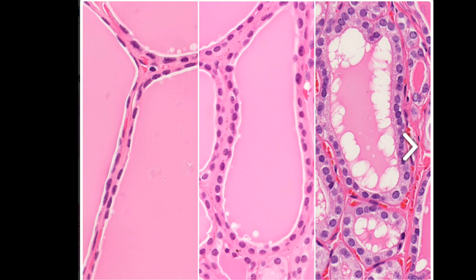This picture shows the simple squamous epithelium of hypoactive thyroid follicles, the simple cuboidal epithelium of metabolically active thyroid follicles, and the centrally located colloid, which contains thyroglobulin.